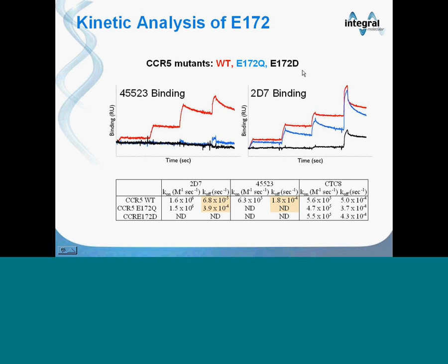So in conclusion, today I've presented 2 novel technologies for studying membrane-protein interactions. The first involves lipoparticles, primarily in biosensor applications. I described 2 different assays. The first was a rapid screening for antibody specificity and affinity, and this can be used to rapidly screen a panel of antibodies or hybridoma supernatants and get a relative ranking of their affinities. And then, following up on that, you could also do a detailed kinetic study on any antibodies of interest.